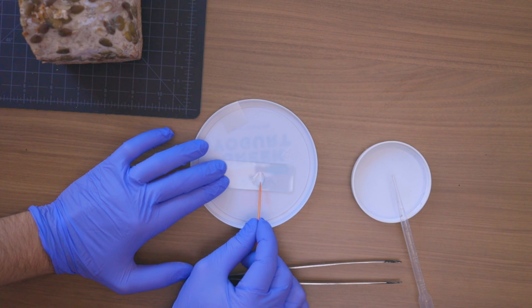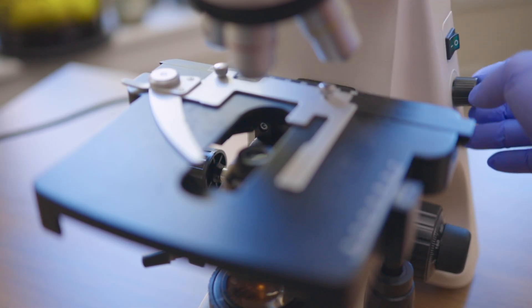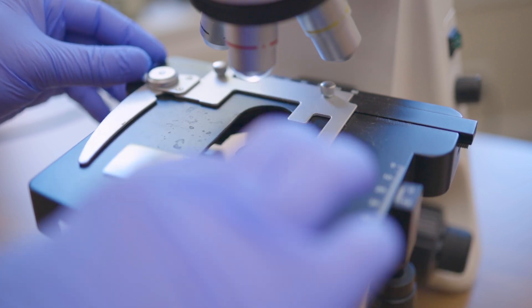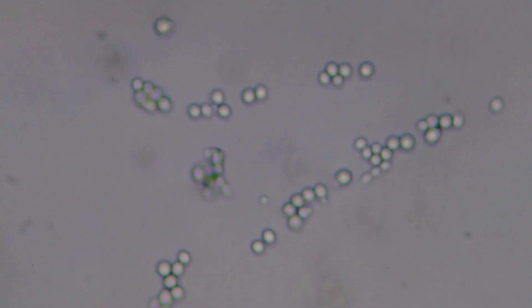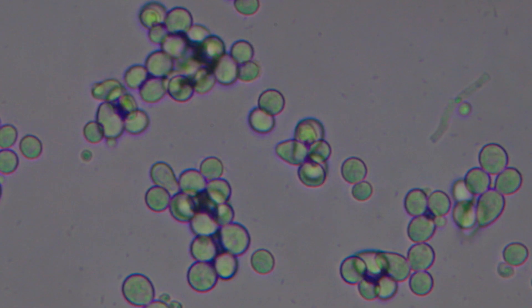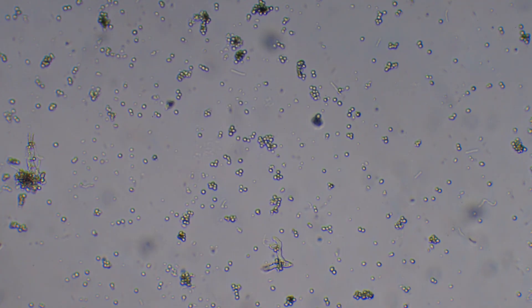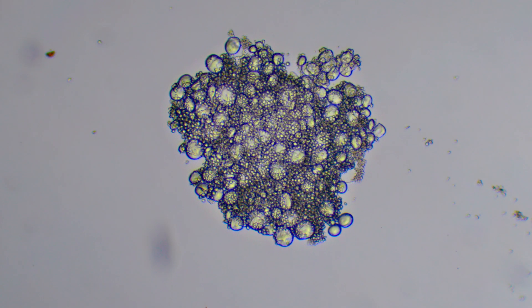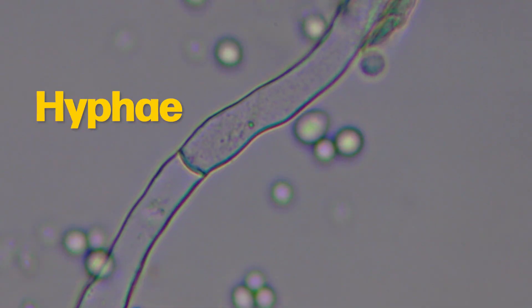Let's take a sample. You are looking at the spores of the mold. Spores are designed to catch any current in the air and take off aimlessly, until they land on something to create multicellular structures called hyphae.